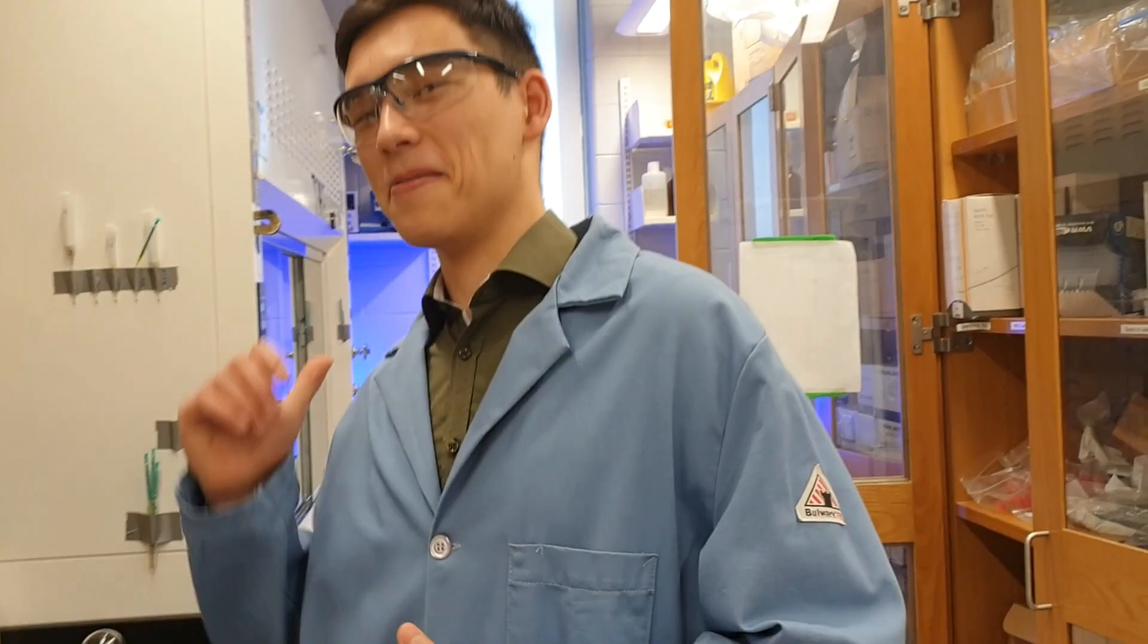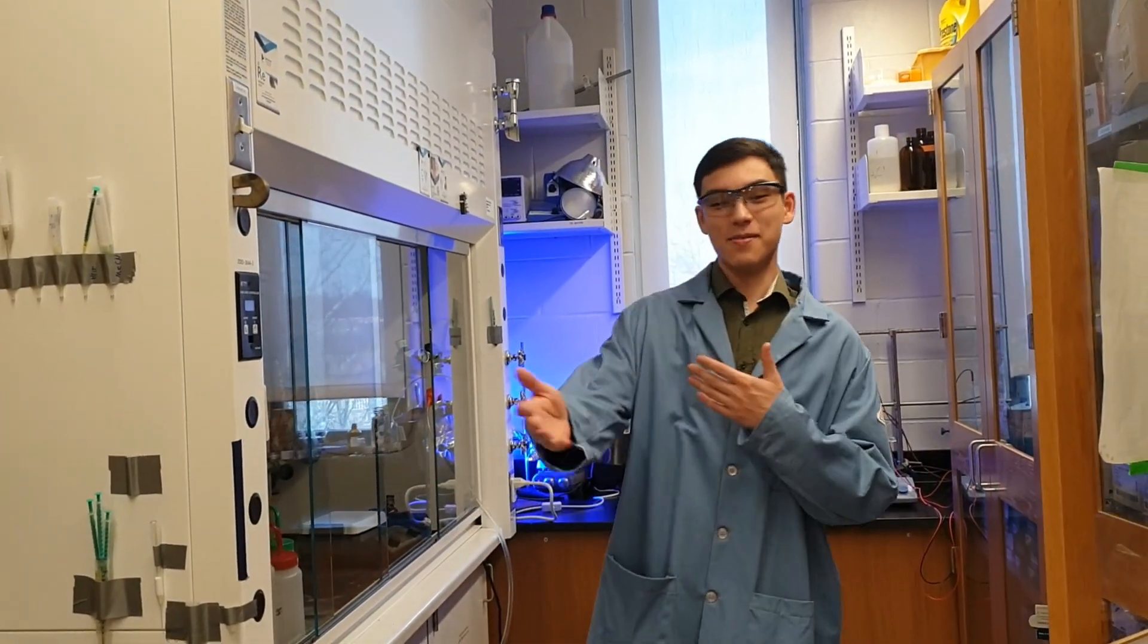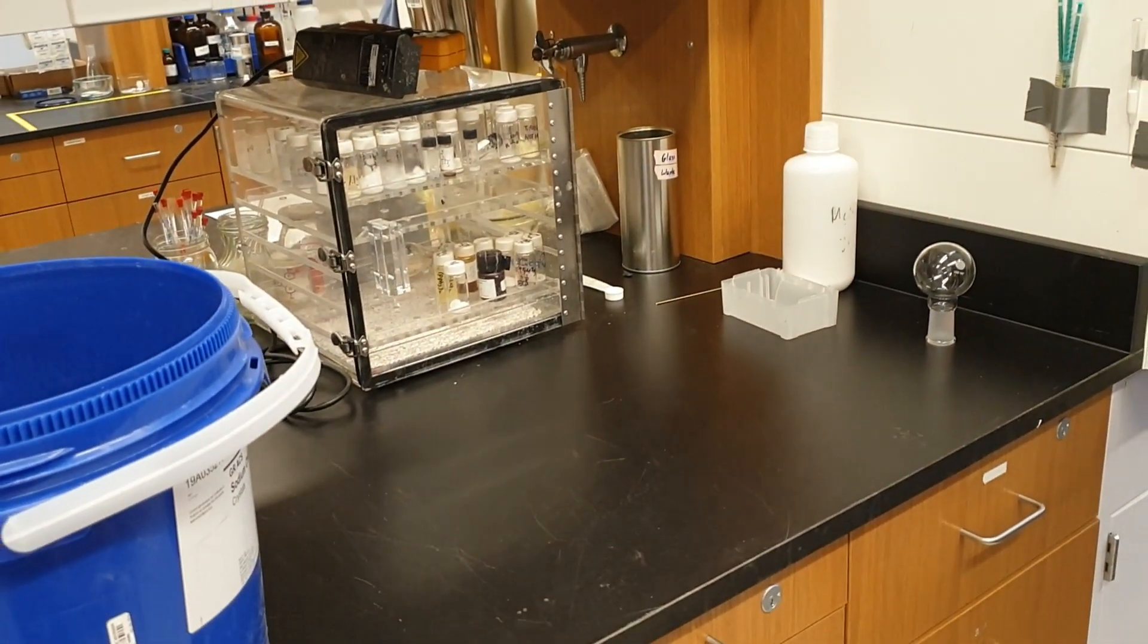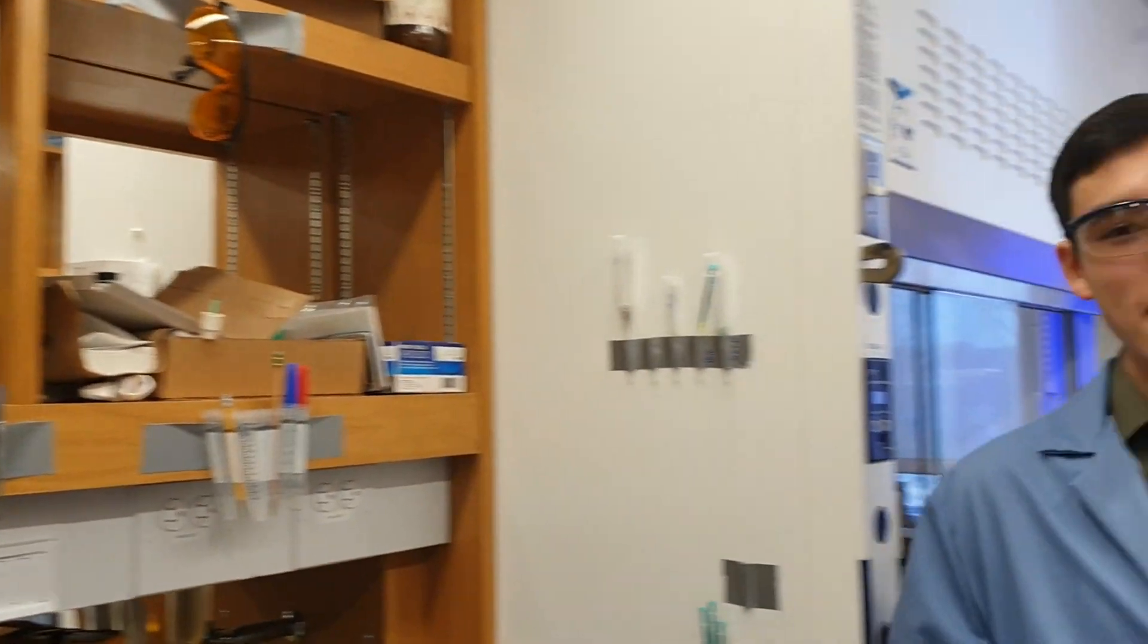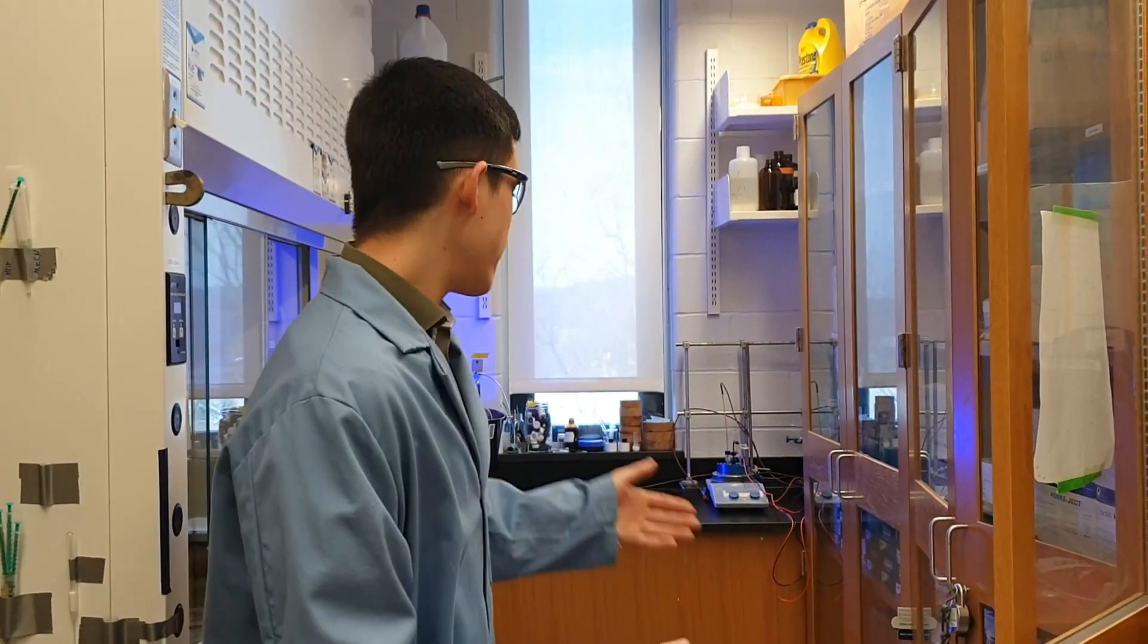What's the blue stuff? Oh yeah. So that's actually my fume hood space, that's my fume hood, that's my bench. I set up two setups for you guys. I really want to show you one normal electrochemistry setup, and one of the electrophotochemistry setups, which you can see by the blue light. But first, let's go ahead and show you the simple setup.